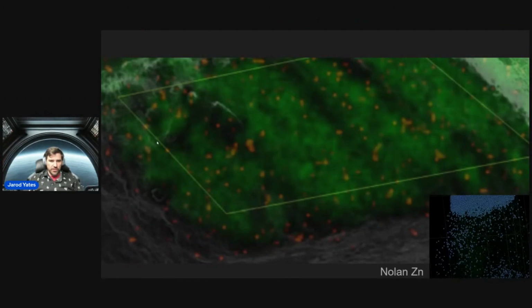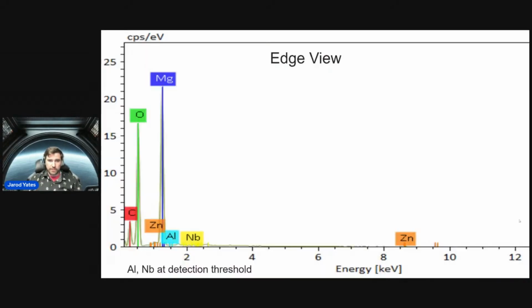So for reference, here are those little cylinders that have some connecting lines going between them. This green is the oxidation going on at the surface, and you can see how we got some lines of zinc, some semi-regular patterns of the zinc. The reason I say that's important is that this picture down here is from Gary Nolan's YouTube video that I just referenced. In their samples, he was noting how some of these atoms in their materials seem to have very specific atomic placements. So it's important to keep in mind that we have potentially atomic placements of certain elements going on in this sample as well.